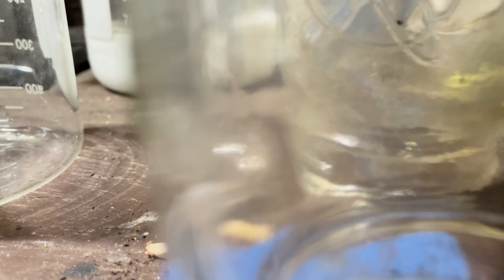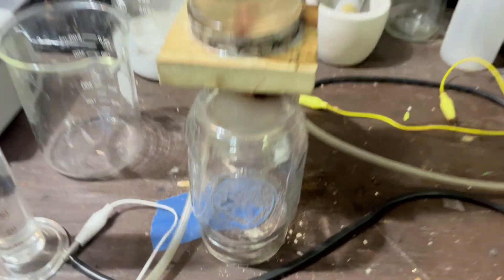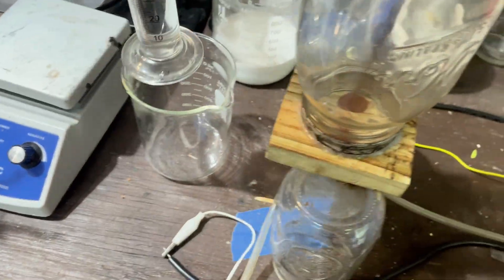Let me put that together. Now that this thing is assembled, it looks a lot more interesting. We got air, and we got our bubble stone and our water.